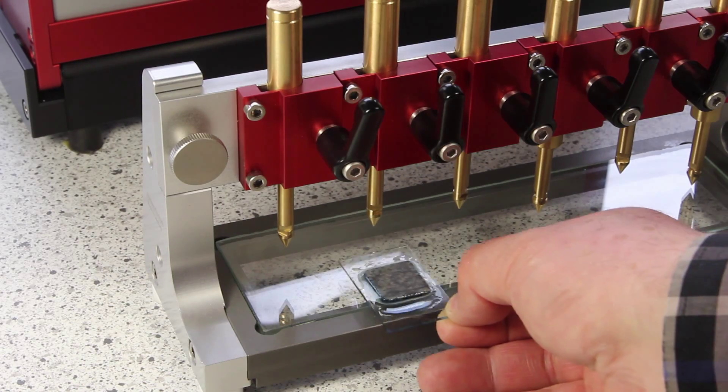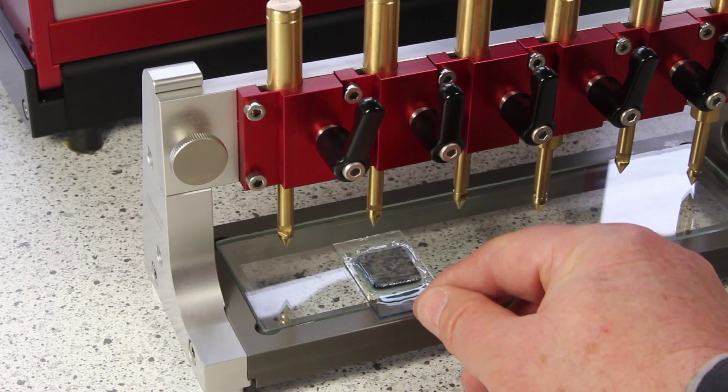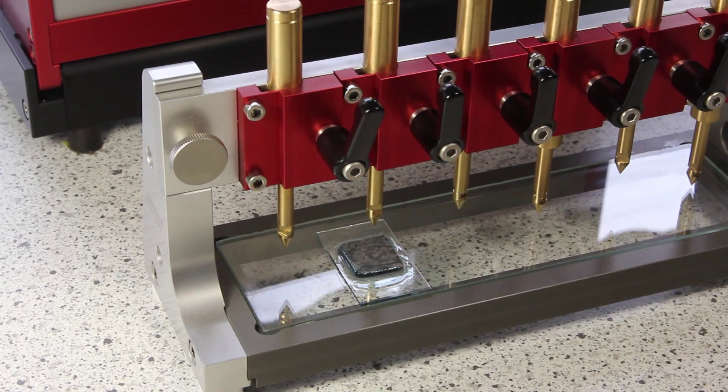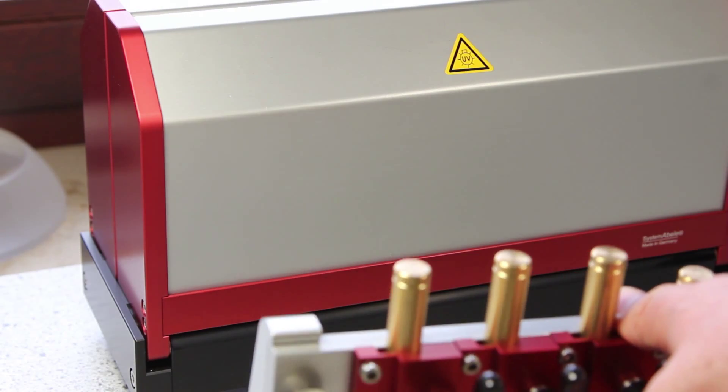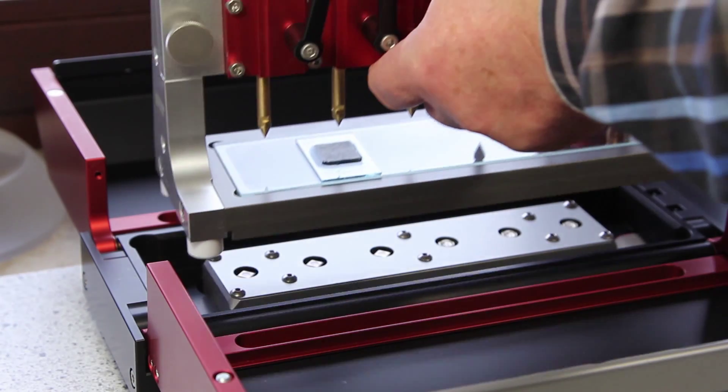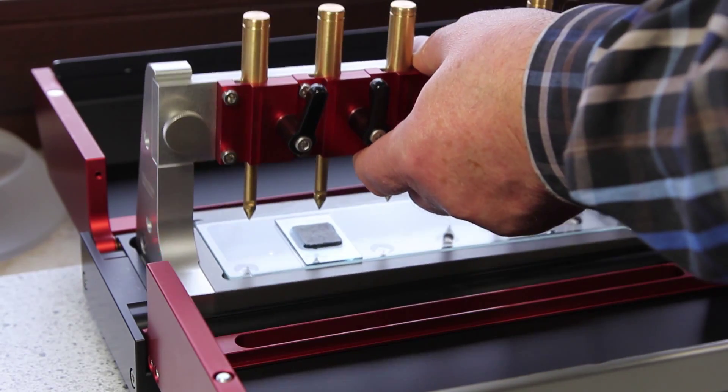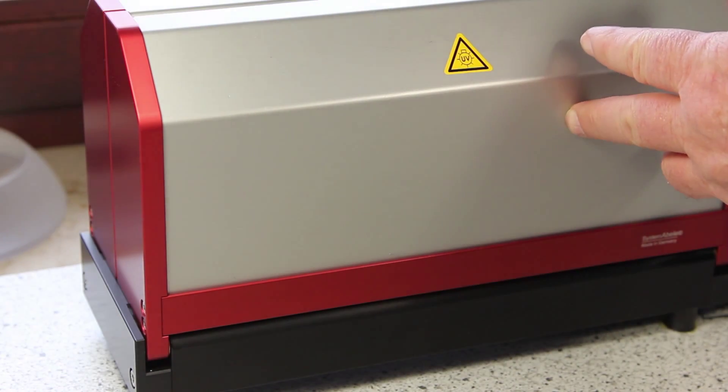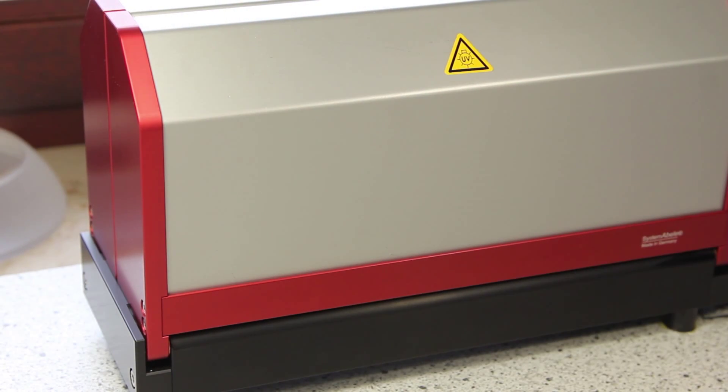Now I put the sample into the jig again. I open the UV case, I put the jig in, I close this, I turn it on and I start it.